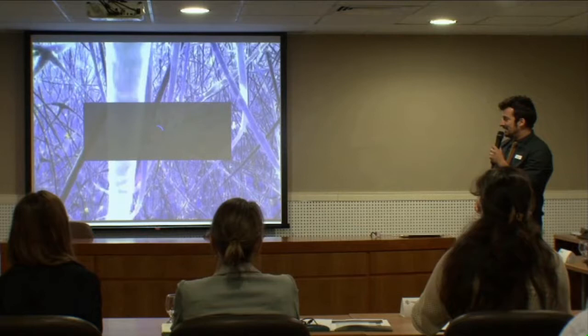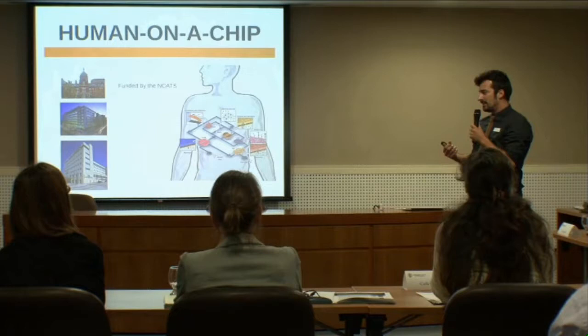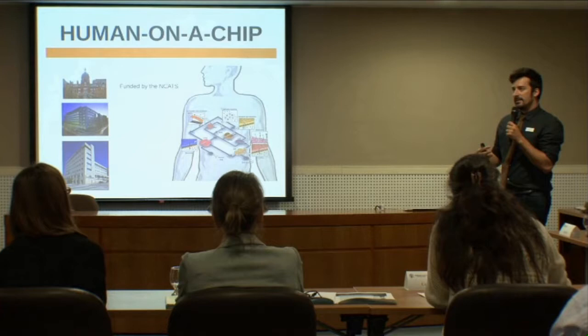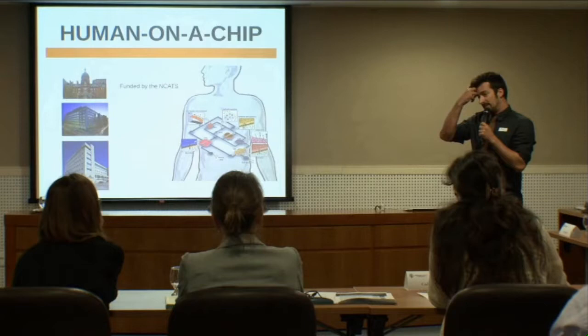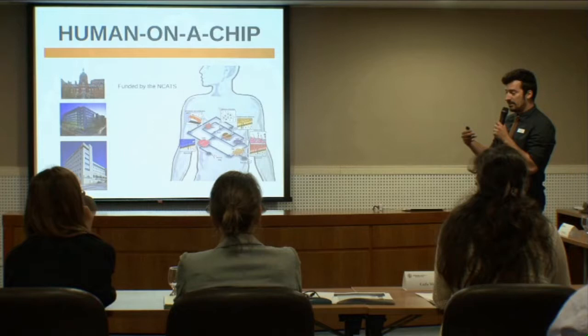So we were interested in developing a brain organ model, but we also work in toxicology. So in our case, we need to find a compromise between complexity and reproducibility. There are many models that people are publishing, but in some cases it's really difficult to get reproducible models every time you produce them. So we were trying to focus more on the reproducibility of the system.